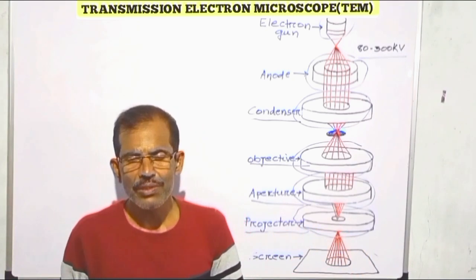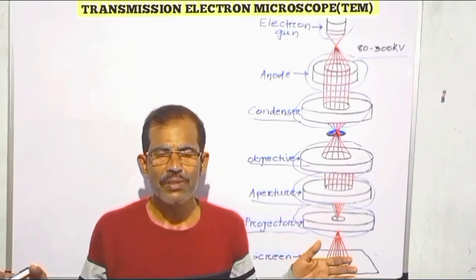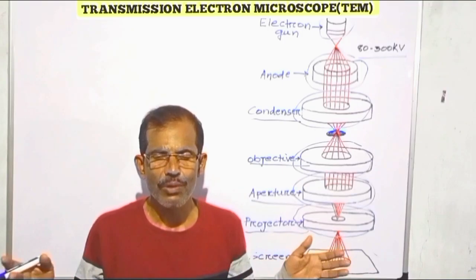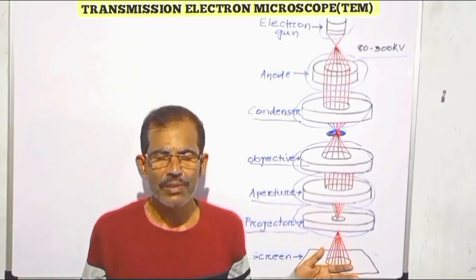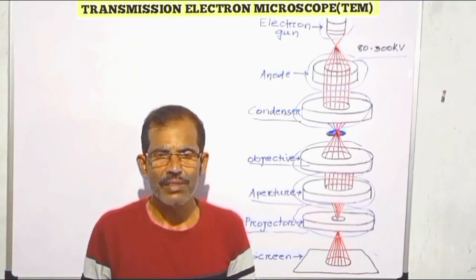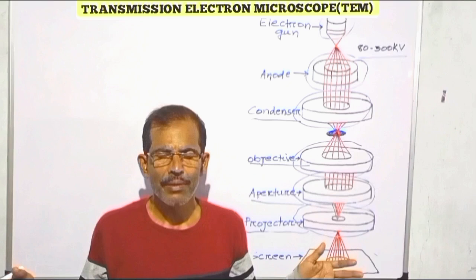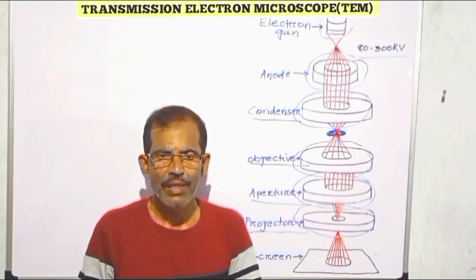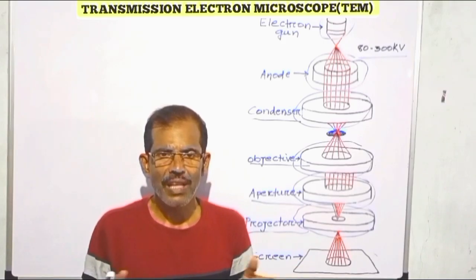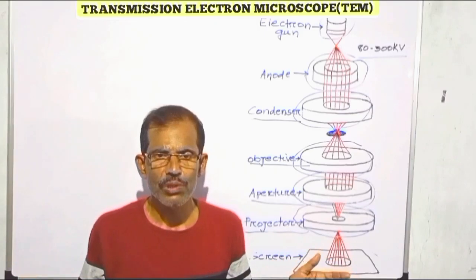In addition, transmission electron microscopy has applications in material science and nanotechnology, in which this instrument is used to characterize nanomaterials and particles at the molecular and atomic level. TEM is also used to examine metals, ores, alloys, and crystals to identify defects, and to examine different samples such as soil and rock to study their chemical composition.